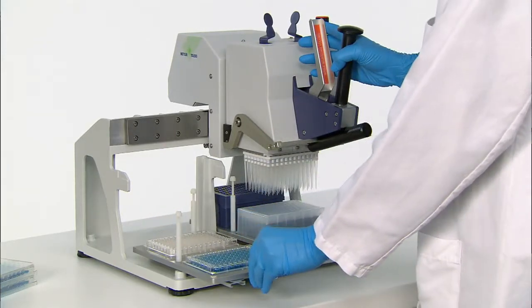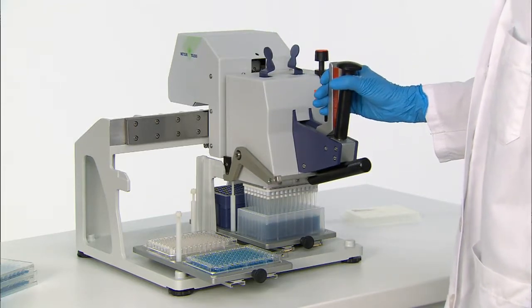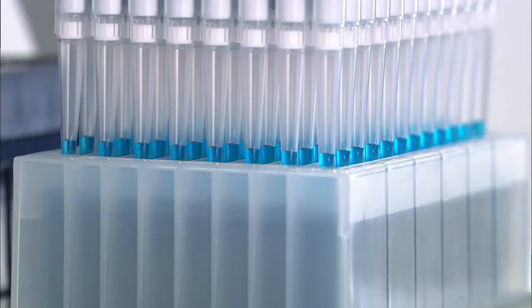The system is now ready to aspirate and dispense the liquid to the second 96-well plate. Move the left tray forward to place the second plate in the dispense position. Observe the absolutely level volumes in all tips.